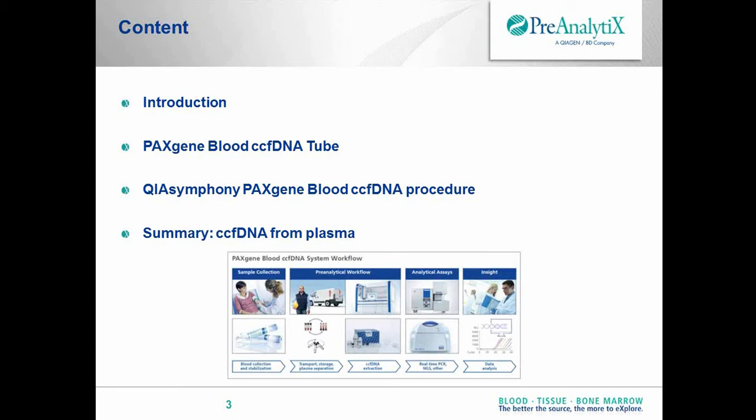In the next part, I will show you the features of the QIAsymphony PAXgene Blood ccf procedure, which is linked to the tube, and together this is the system that we introduce here. Finally, I give you a summary about all these isolation and stabilization procedures in the context of the whole ccf and liquid biopsy campaign here at QIAGEN.